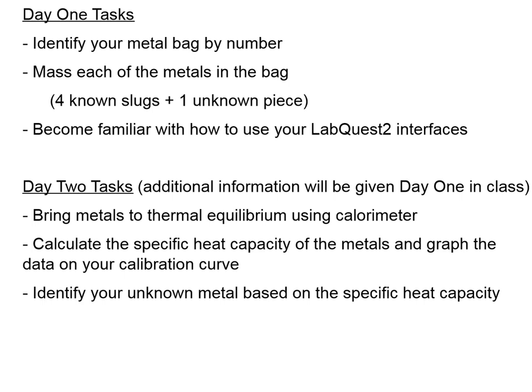You want to make sure you have the same bag because you want to make sure you have the exact same slugs, since you spent part of day 1 getting the mass of those metals. Okay? And you're also going to become familiar with how to use your LabQuest 2 interfaces. Okay? This is what we're going to use in lieu of a thermometer. Okay? You are going to use a temperature probe to measure to the 10th of a degree Celsius any temperature changes that are occurring. Okay?